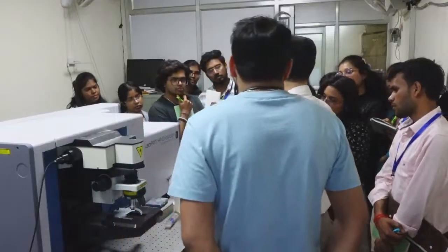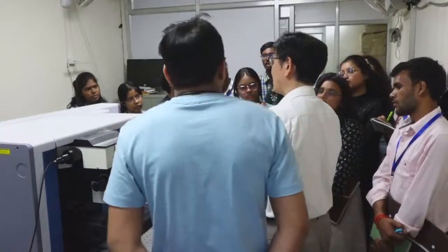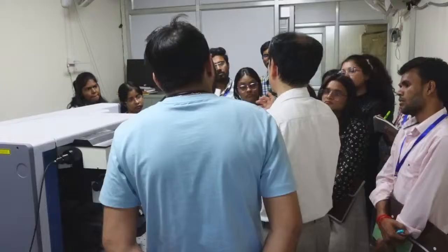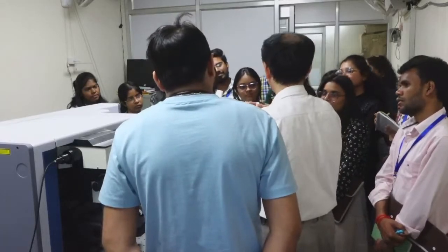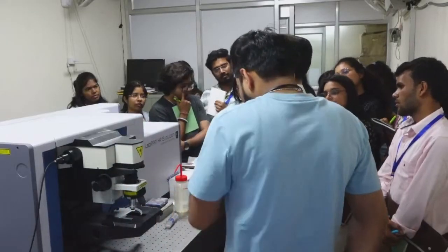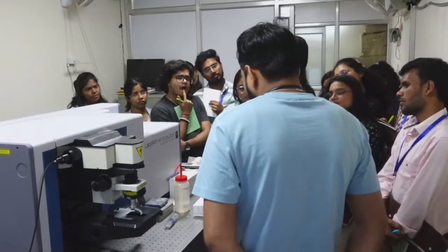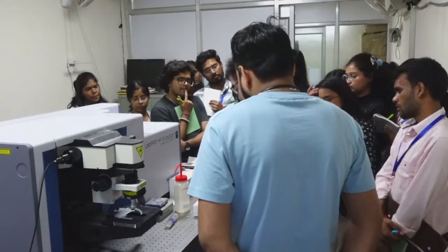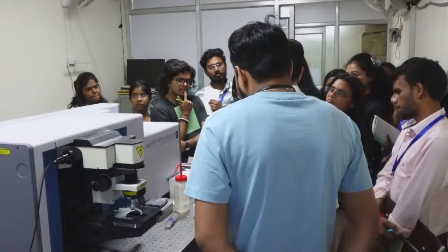If this is a protein sample, say 1 milligram costs 100 US dollars or something, then such a volume is very difficult to prepare. So a precious sample is usually obtained in a very limited volume. So it's preferable if we can measure a smaller volume.